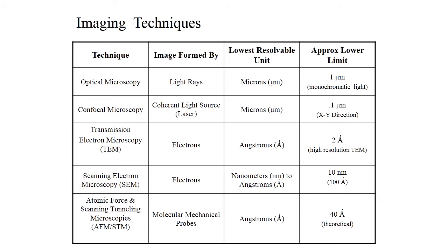So now I'm going to talk about a few important techniques which we are going to talk about in some detail in the coming slides. One of the important techniques which we have been routinely using is the typical optical or light microscope. This method uses light rays, and it has a resolution of the order of a few microns.